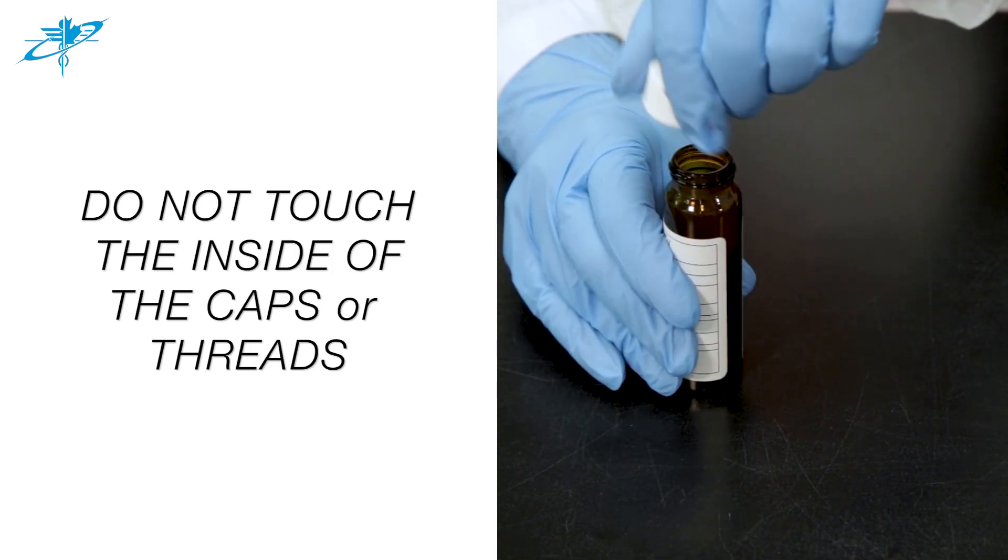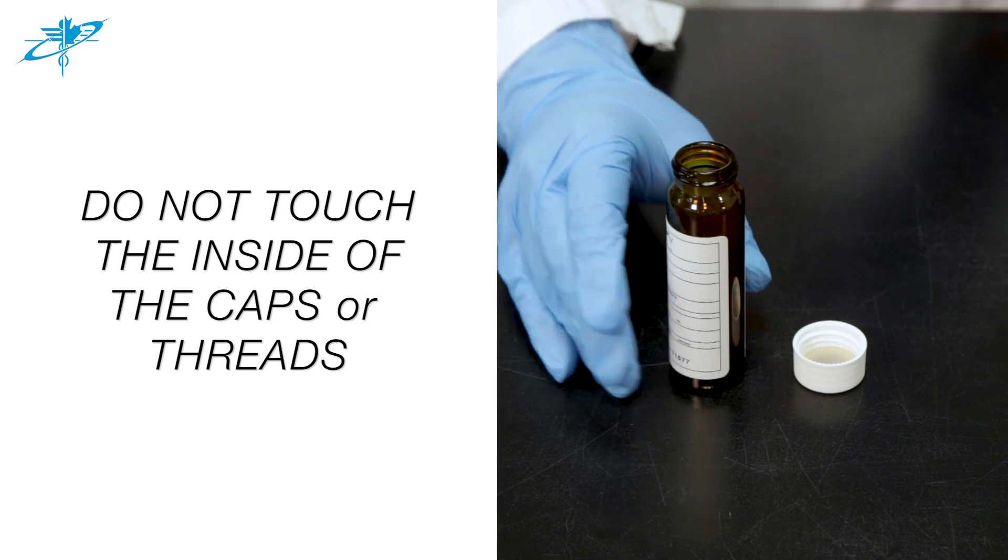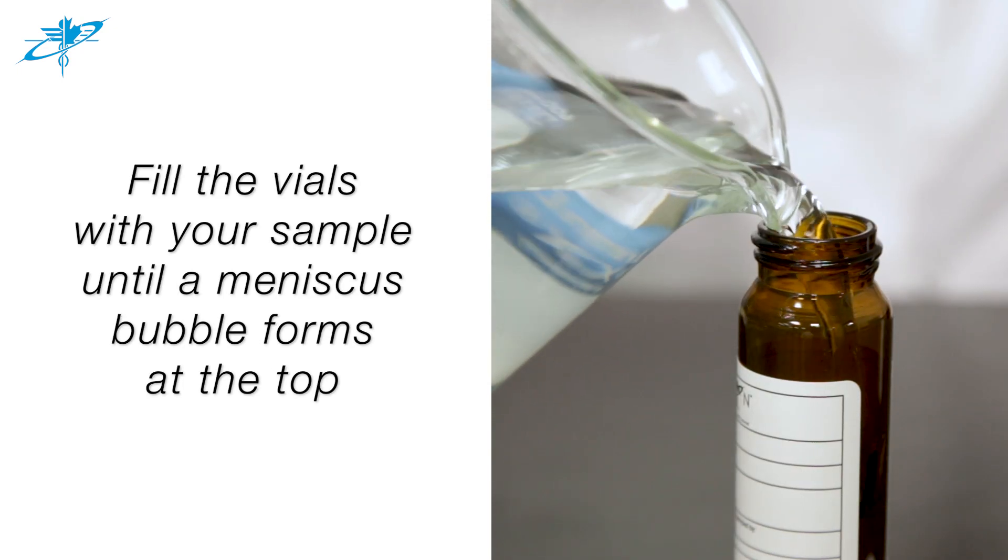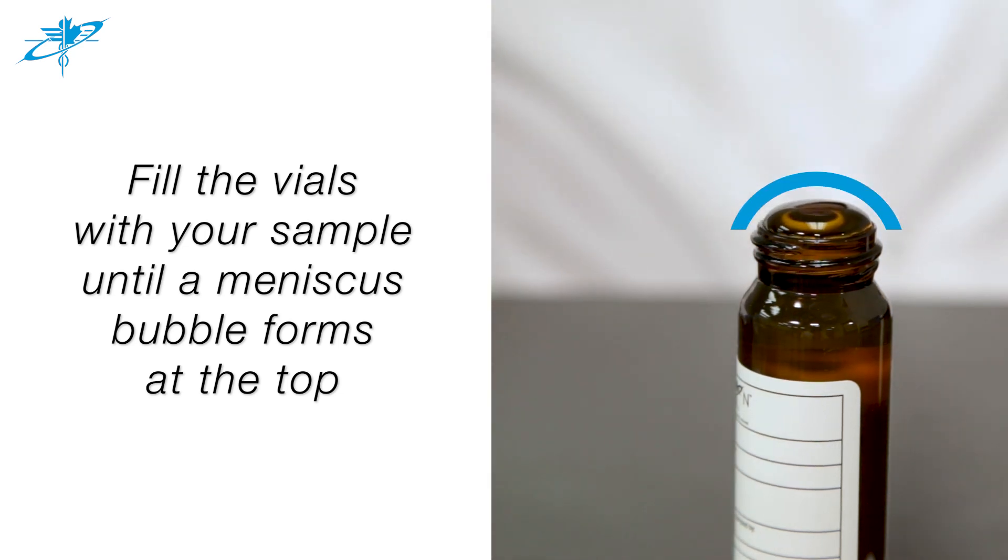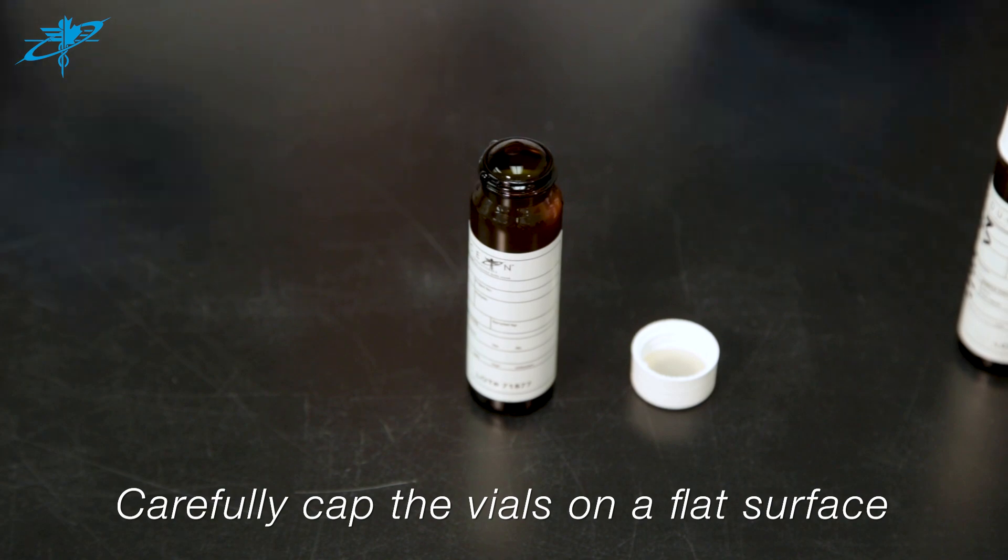Fill the vials with the sample until there is a meniscus bubble at the top. Place the vials on a flat surface and carefully cap the vials. You will notice the top of the cap becomes darker in color.